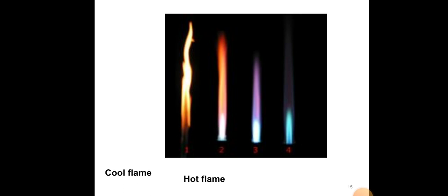When you increase the concentration of air or the oxidant, the flame will be hotter. So on the right side, you can see a hot flame which is rich in oxidant.